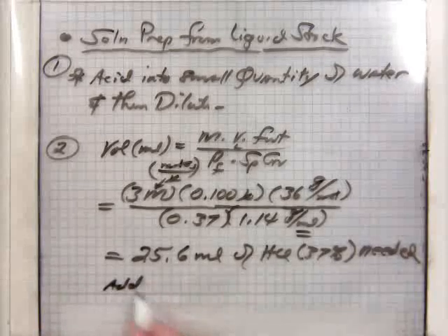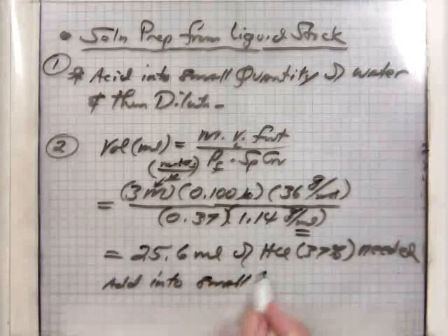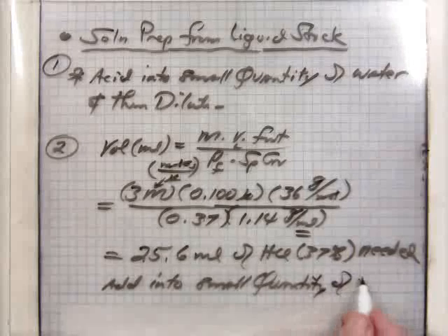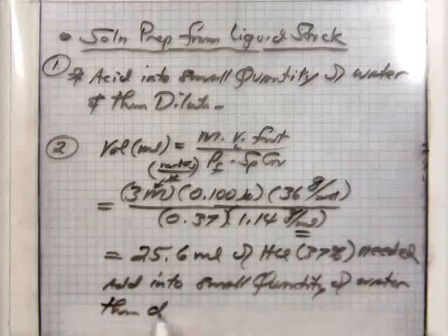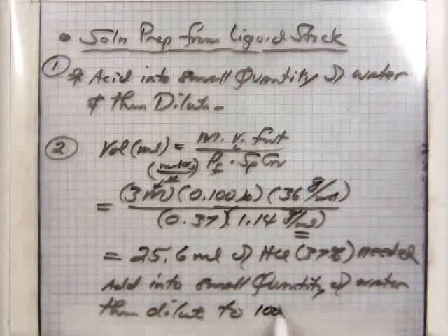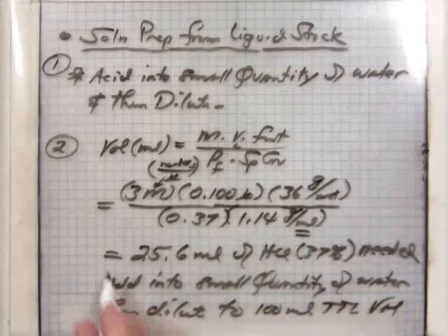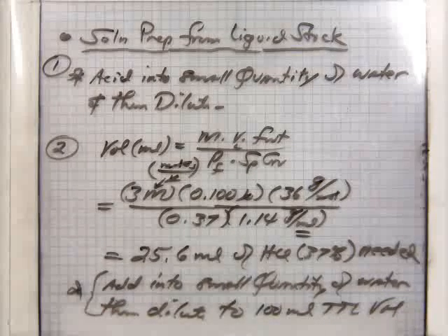Add it into a small quantity of water, then dilute to 100 milliliters total volume. I emphasize that enough that hopefully it'll sink in.